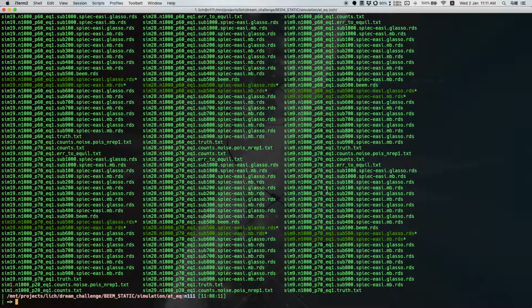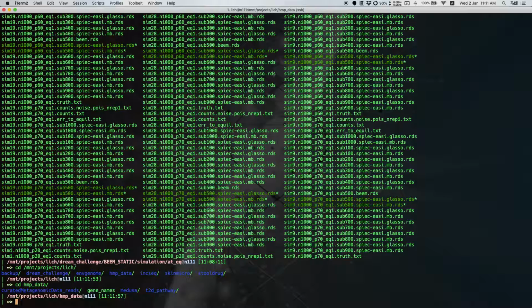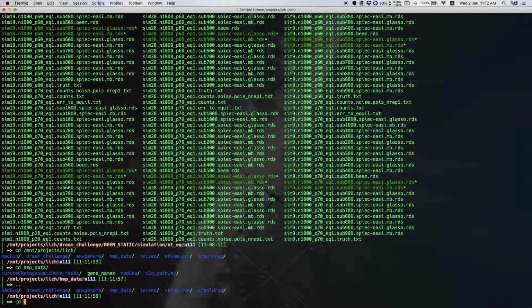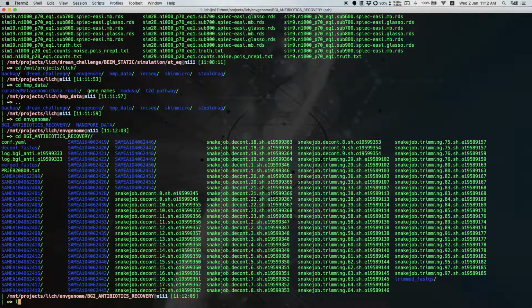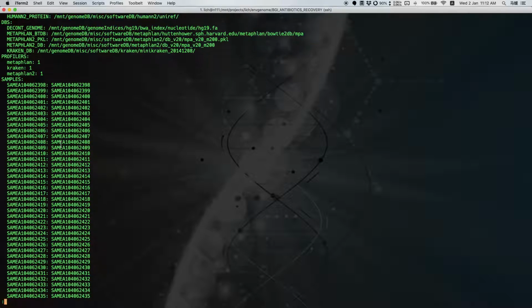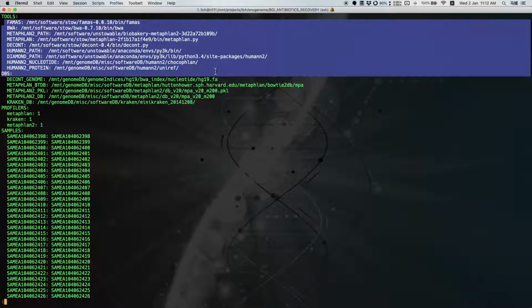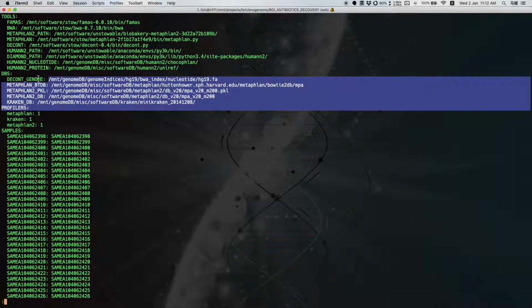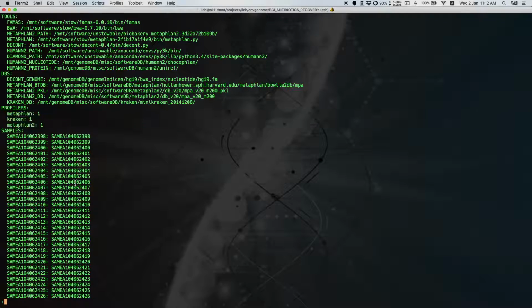So if you create a configuration file for you, for example, in this project, if you create this conf YAML file with all the folders, this will define the tools, the directory for the tools, the path for the databases, and the profilers to run. Okay. So how do you create the config?